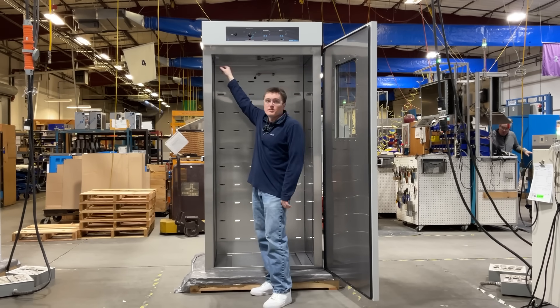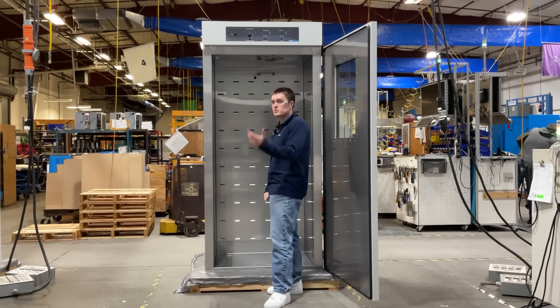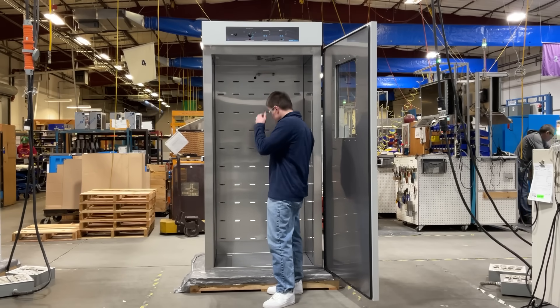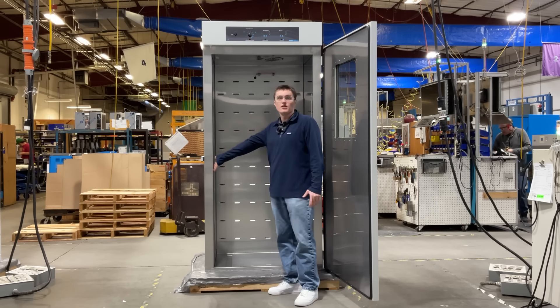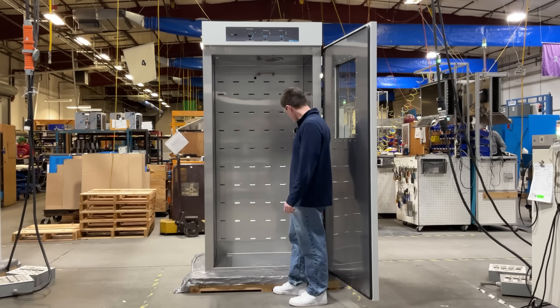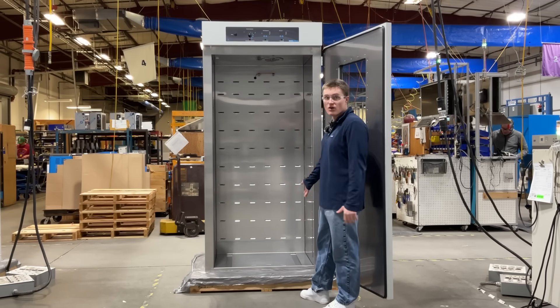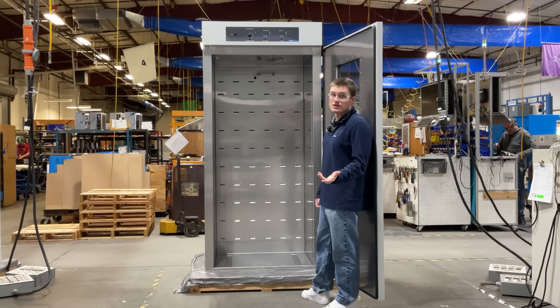Also located at the top is the convenience outlet. This allows you to power any devices that you want to have within the chamber while it's in operation. We also have the shelf mounting points. These allow you to mount up to six included shelves with your unit. Additionally, at the bottom are the tracks for the rolling stand, which is an accessory available for purchase.